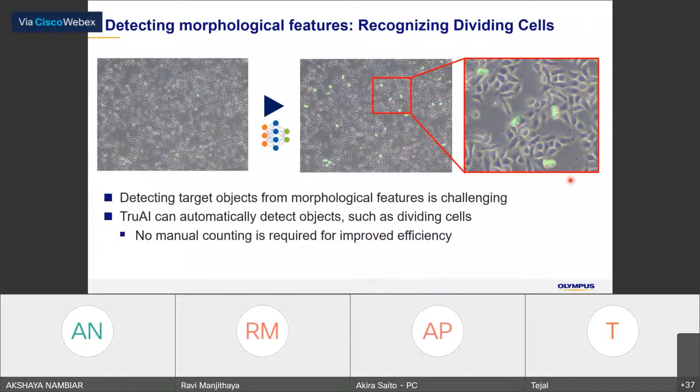So it might be difficult, by using the intensity information or color information, to identify this kind of metaphase of the cells in the phase contrast image.